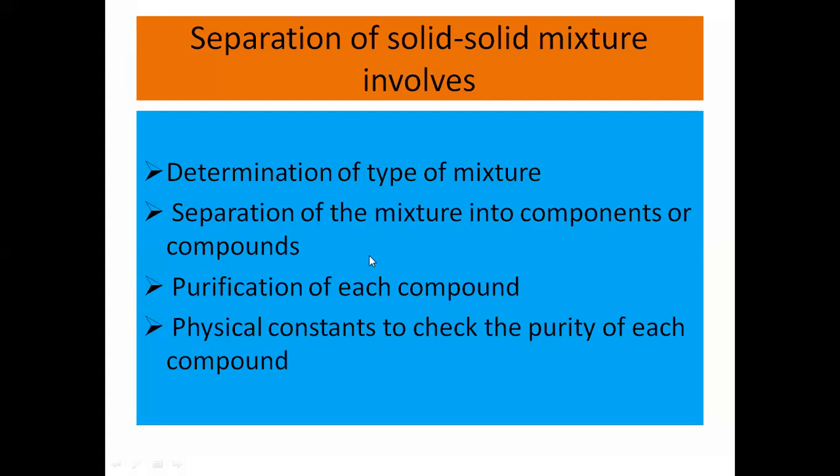we'll see. Now see, what you have to do in the practical is the separation of solid mixtures. First you will determine the type of mixture, whether it is acid phenol, acid base, or base neutral. Second, you have to separate this mixture into its components or compounds. Then the next one, you have to purify each compound, and then take the melting point, a physical constant, to check the purity of each compound. These are the steps involved.